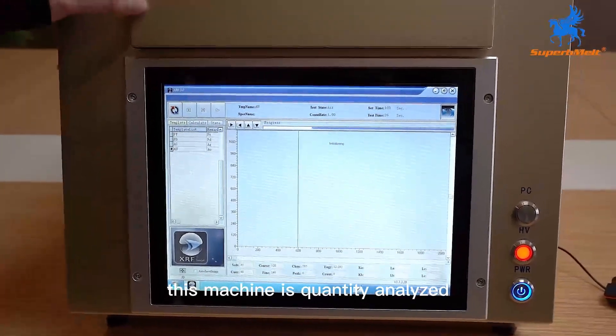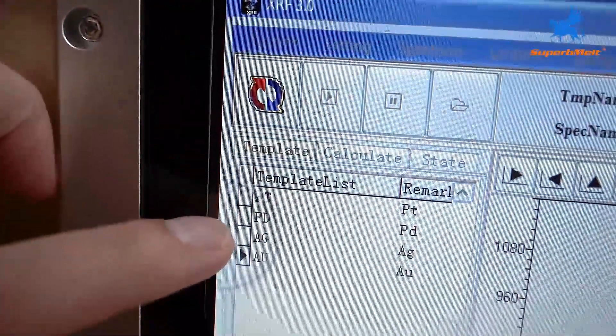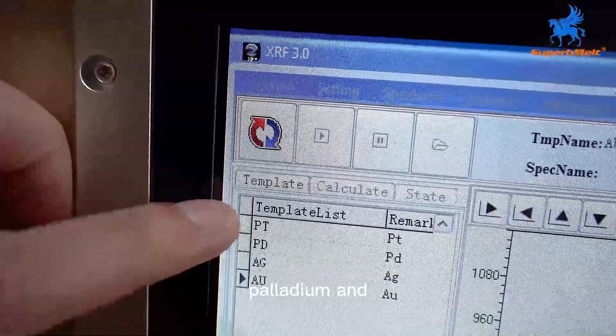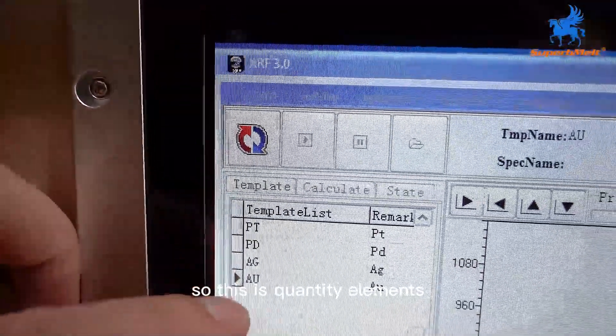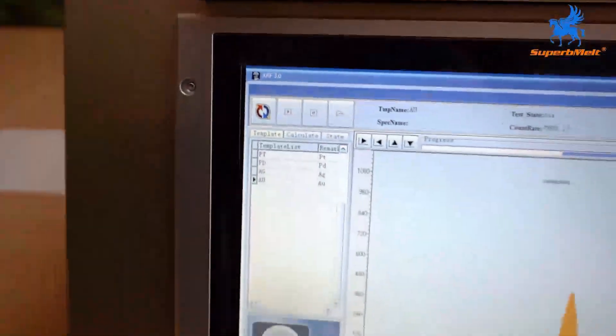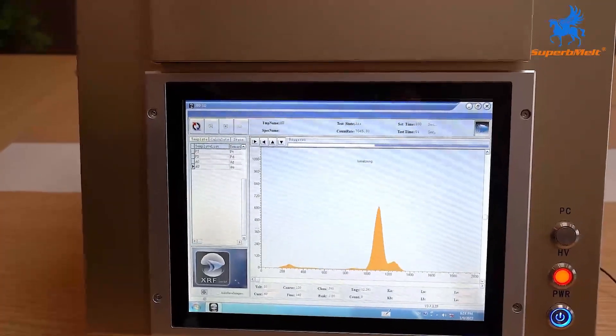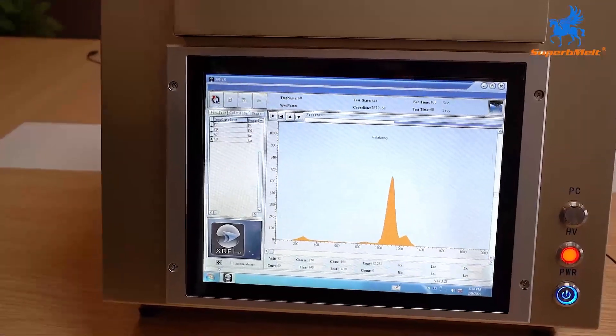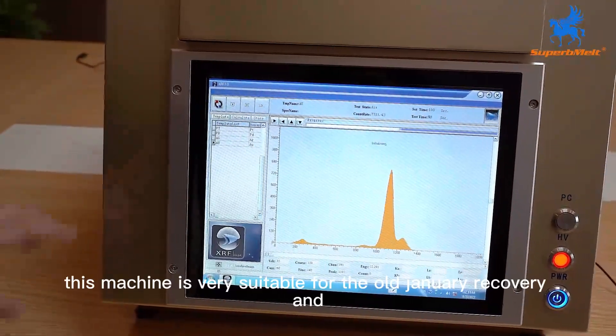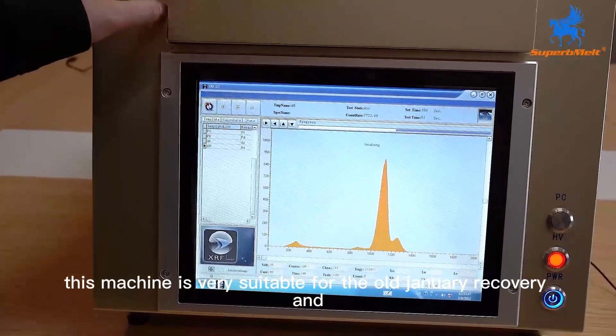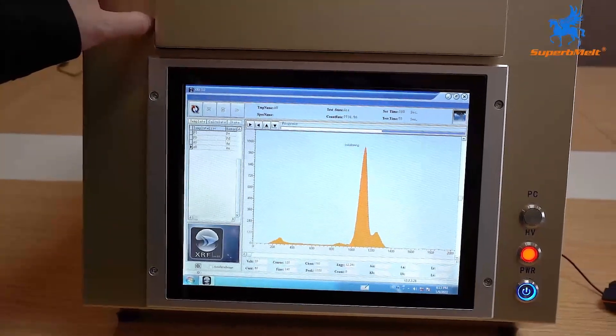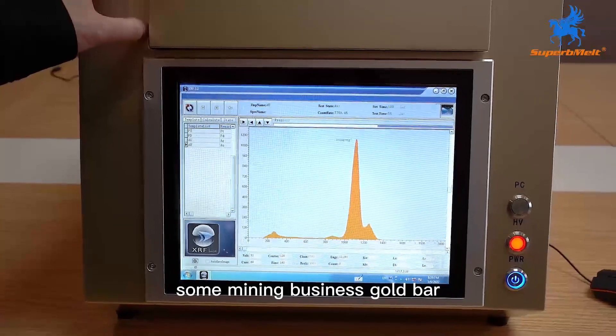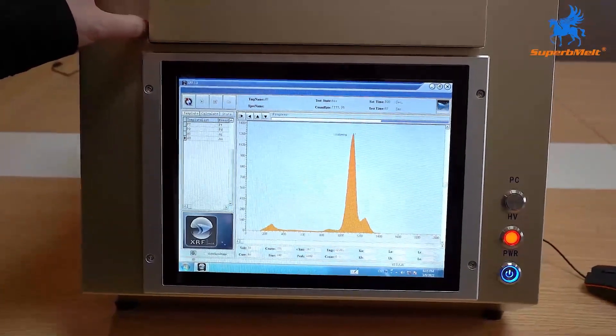This machine is quantity analyzed gold, silver, platinum, and palladium. These are quantity elements. This machine is very suitable for the gold jewelry recovery, and some ore, some mining business, gold bar, mining and sale.